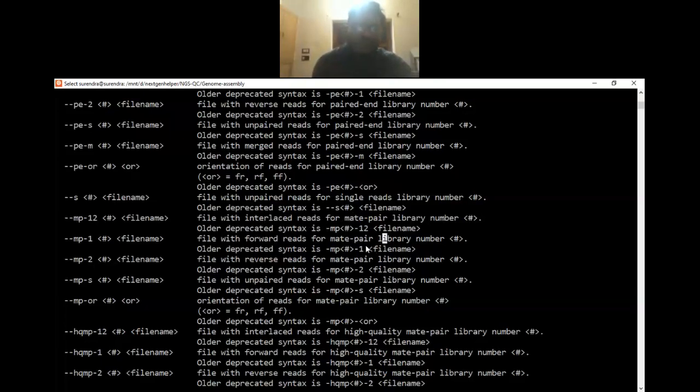Yes, so KBase is available. I think it is free to use, and you can use most of the tools available there. You need to create an account, and then the data is kept there for 90 days. So you can use these tools on that web server. Galaxy also you can use if you want to.